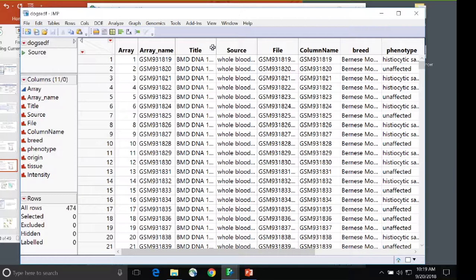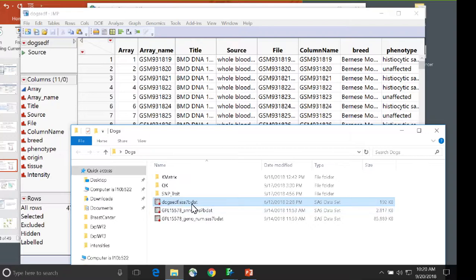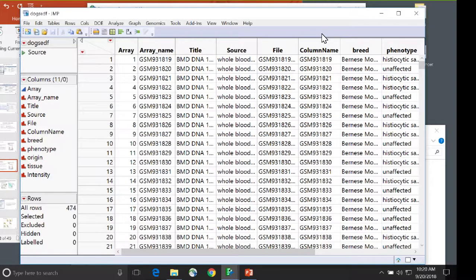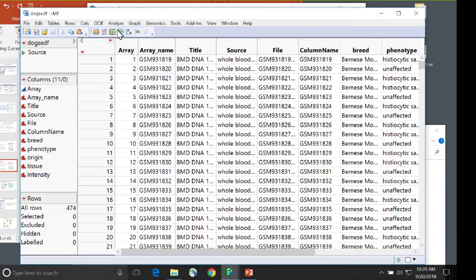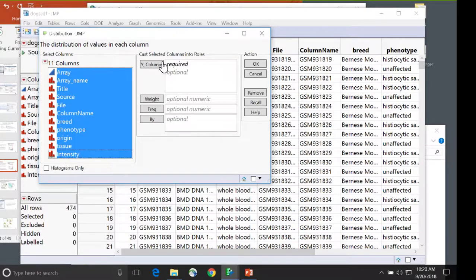One thing that can be a little confusing when starting to use JMP Genomics is that you generally look at datasets in JMP, but they're saved as SAS datasets with a SAS7BDAT file extension. Because JMP and SAS work together, you can easily open it in JMP. But keep in mind you want to keep saving it as that SAS dataset because that's how it runs internally through SAS. Using JMP's Analyze and Distribution menu, you can explore the variables in the data.